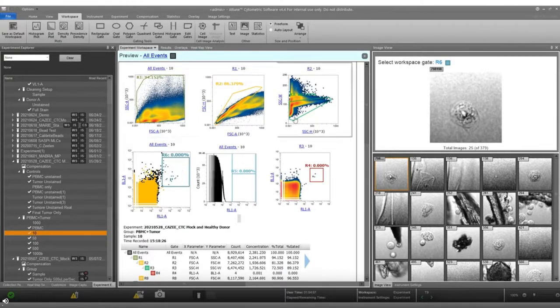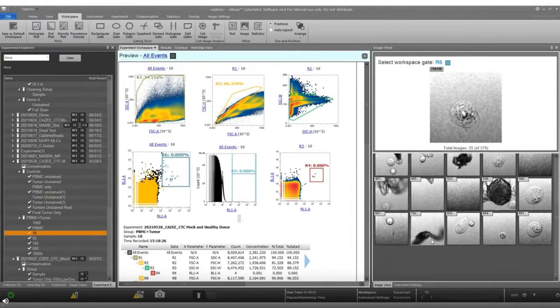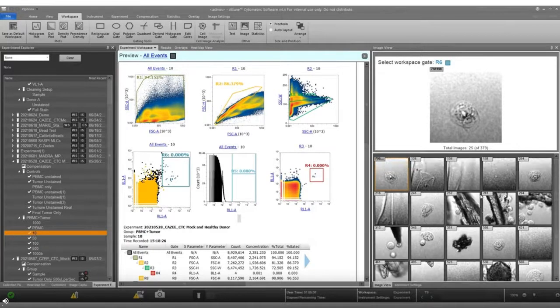But once we come to our imaging cytometer, we can see that, in fact, most of those positives are debris and other cells or doublets, or who knows what is in there. Also, another nice big reveal is how dirty our sample prep can be sometimes once we are able to look at all these cells in suspension. So there should be about 10 tumor cells in here.